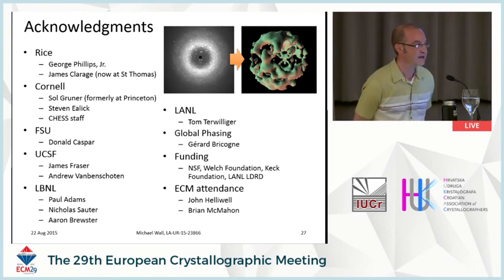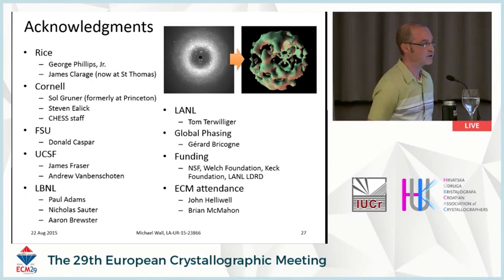Yeah, so that's a good question. I think with the diffuse scattering, what we need to keep in mind is that you have a lower absolute intensity on a pixel by pixel basis, but you have that intensity spread out over a larger number of pixels. So really we need to keep in mind what is the actual intensity that we're looking at. So it can be a little bit looser, or less precisely defined to some extent, than integrating a single Bragg peak.